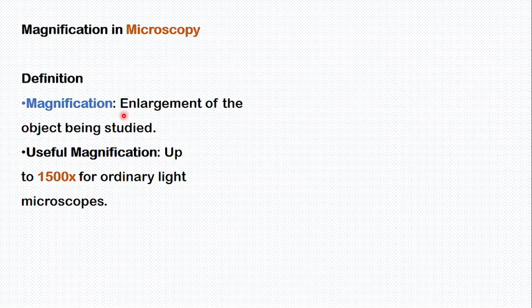How the image is increased, that is magnification. Take it in mind: magnification is the enlargement or increase of the object being studied.